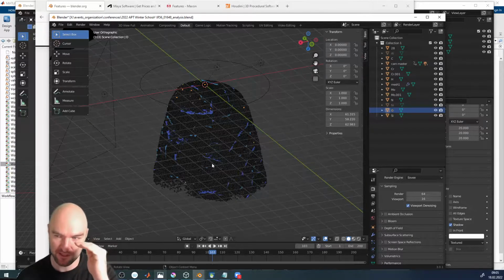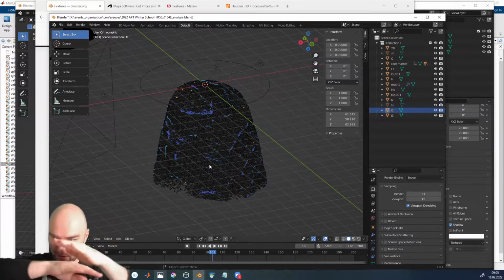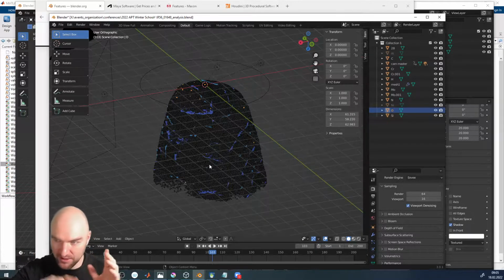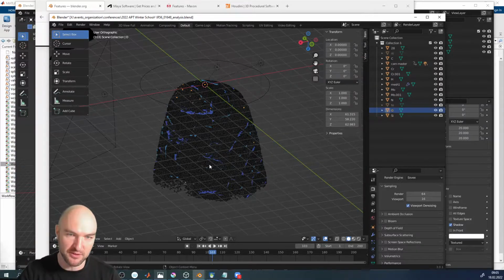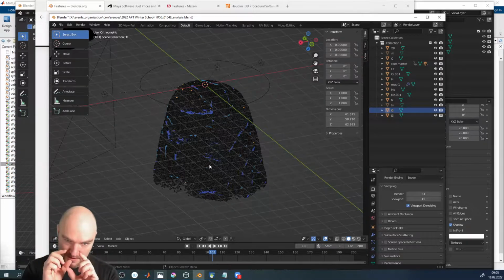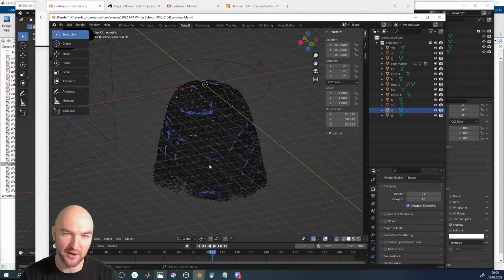Yeah? We have a voxelization, yeah? So we chop our data set into little blocks, and we calculate concentrations of each little block, and then we're sort of outlining which blocks have the same concentration. And if your histogram bins have very, very few counts in them, because after all we're counting atoms, this histogram can get very noisy, and the resulting isosurfaces can get very noisy.